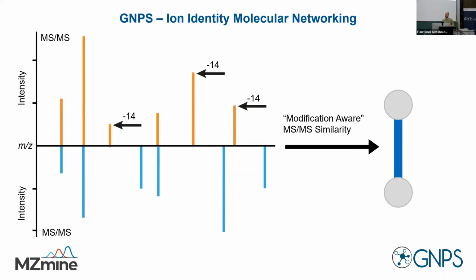So hence there are these values, but what you actually want to use depends on your data set. I would suggest to start with the default values. That's why we did this, and normally we get relatively good results with it, but you might want to look at this later on. The networks from the default settings are kind of digestible. Most of the very prominent connections will be there, and you can go through the graph and make your connections of those annotations. But you could also play around and connect everything. You can make it more complex this way.